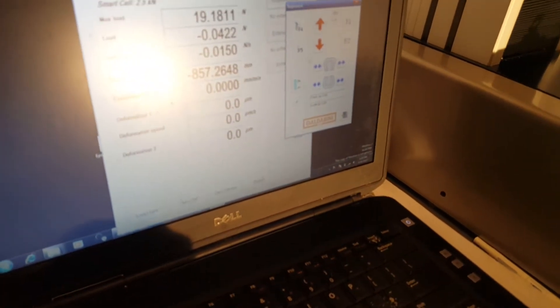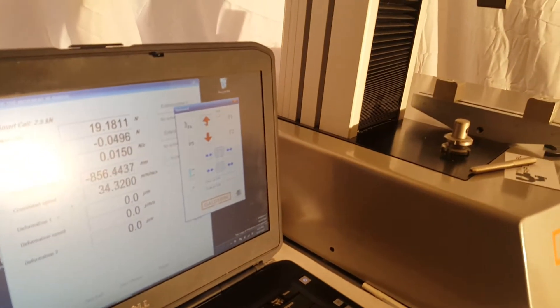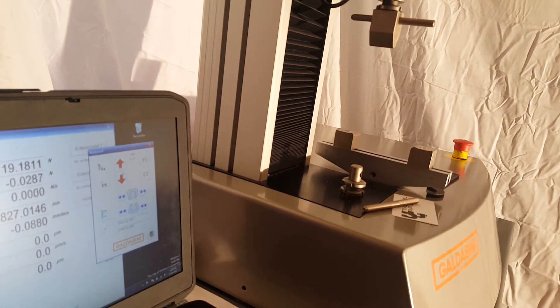If I want to drive the machine in manual mode, I open up the keyboard here. If I press the up button, the machine will start moving up, and then in the other direction back down.